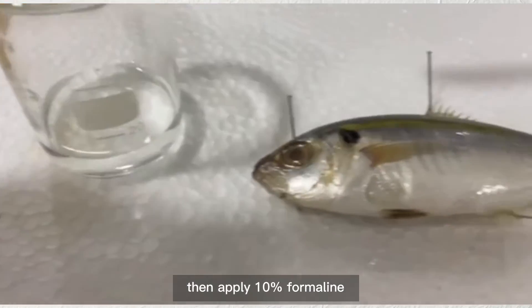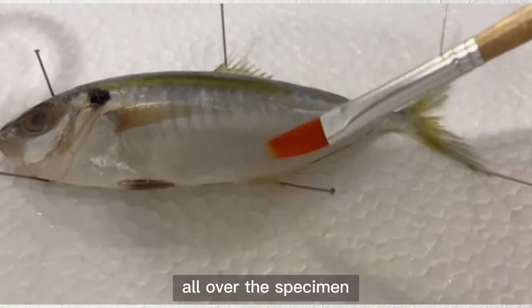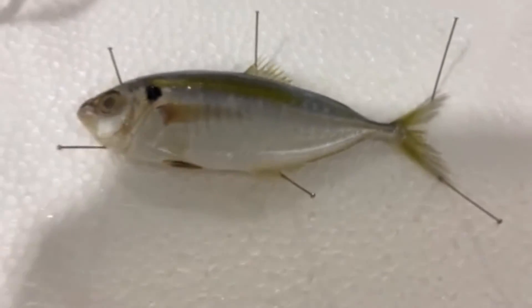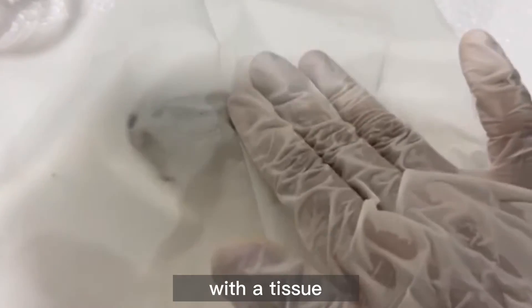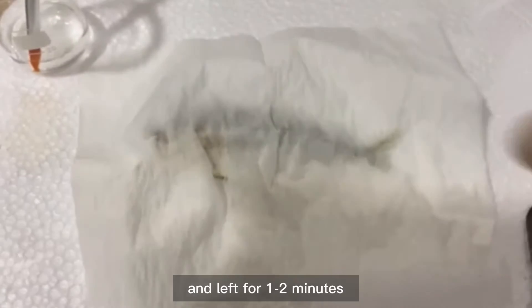Then apply 10% formalin using a paintbrush all over the specimen. Now cover your specimen with a tissue. Spray with some water and let it sit for 1-2 minutes.